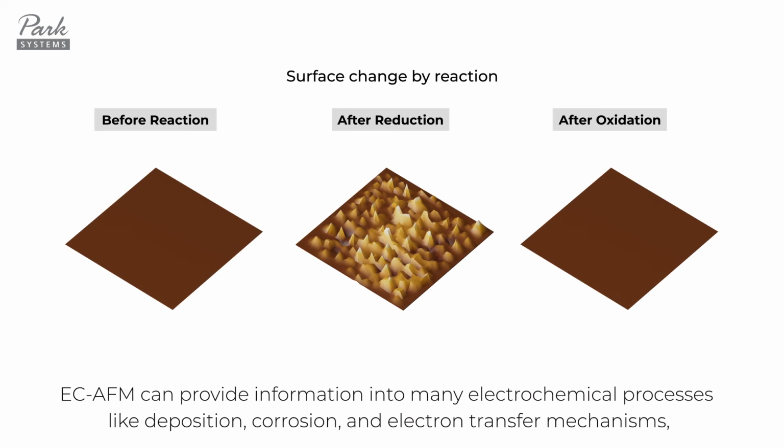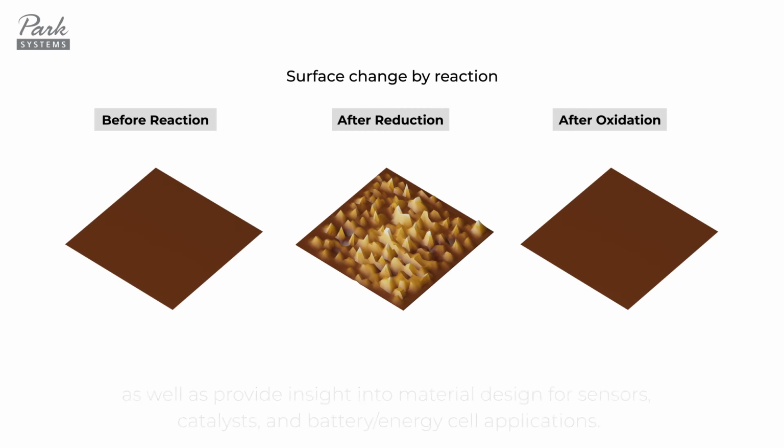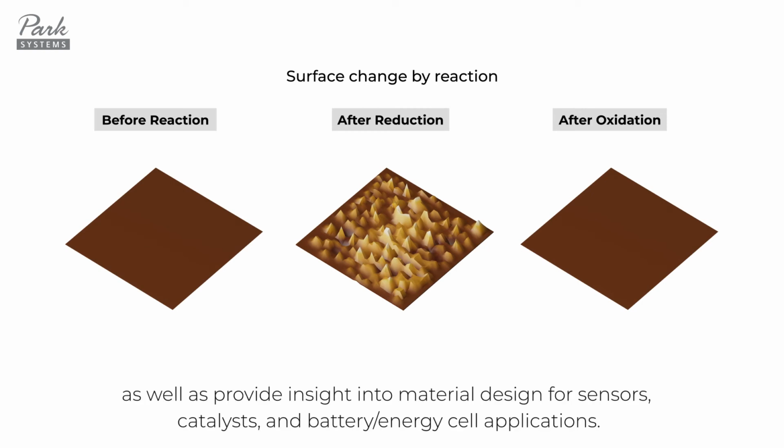EC-AFM can provide information into many electrochemical processes like deposition, corrosion, and electron transfer mechanisms, as well as provide insight into material designed for sensors, catalysts, and battery or energy cell applications.